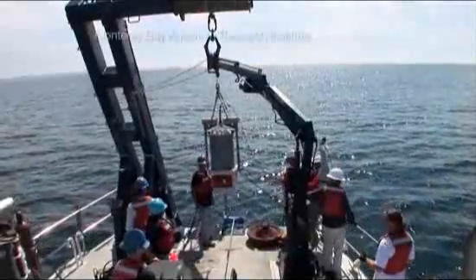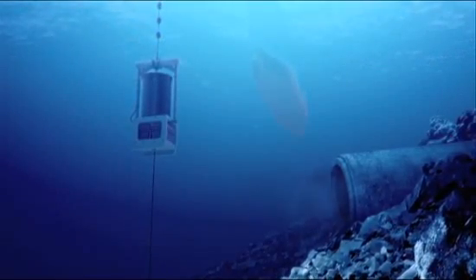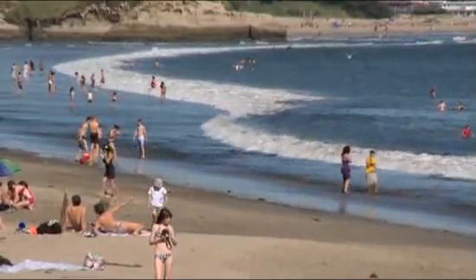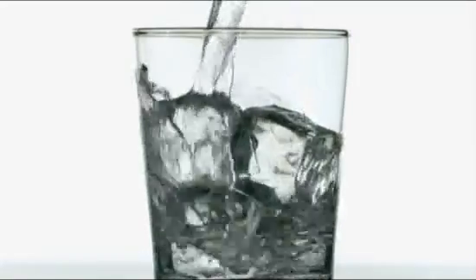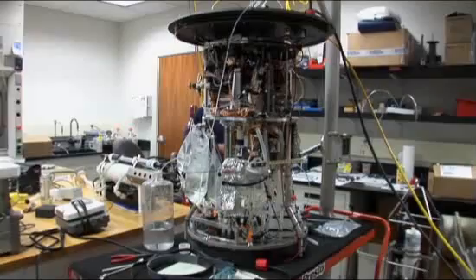It looks a lot like a garbage can, but it's actually a fully functioning laboratory thrown overboard to analyze water samples in the open ocean. One day, a machine like it might tell us whether a beach is safe for swimming or if water is clean enough to drink. The so-called lab in a can is nicknamed ESP.